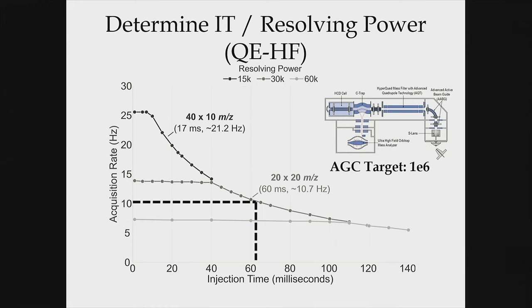In many cases, you'll have a very strong signal, and you'll fill very quickly, and you'll perhaps be scanning at an effective 14 hertz for many of the scans. So you'll scan at least as fast as 10.4 hertz and hopefully faster. Any questions on that stuff?